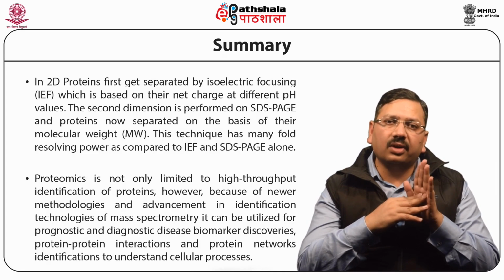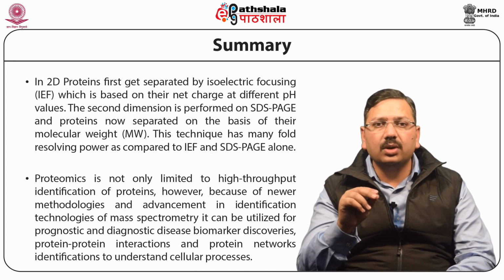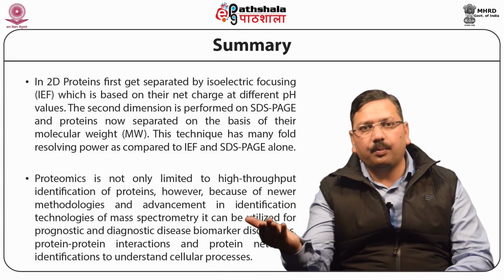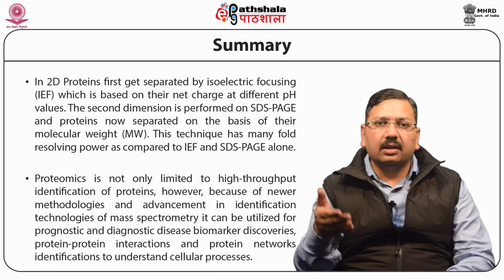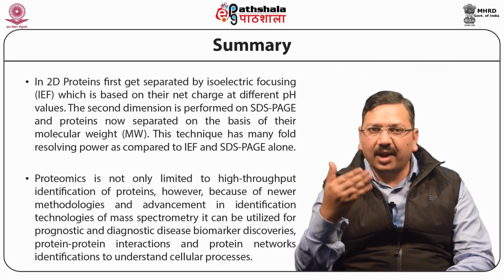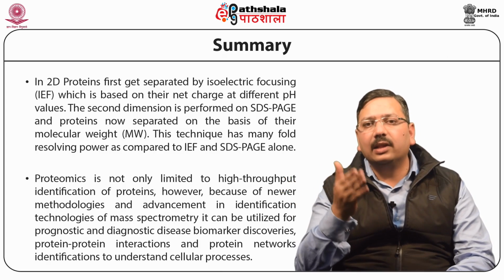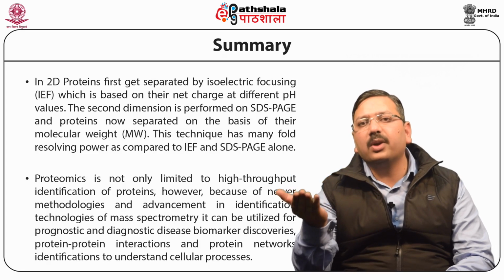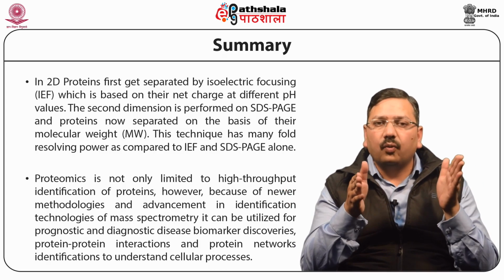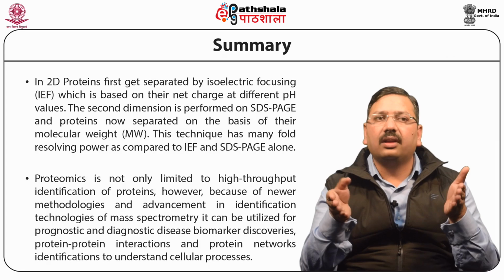Mass spectrometers serve for the establishment of the molecular weight of the molecule, structure of both inorganic and organic compounds, and the identification and determination of analytes in a complex mixture. This also helps in the establishment of different proteomics studies which are happening these days in biological sciences. Thank you very much.